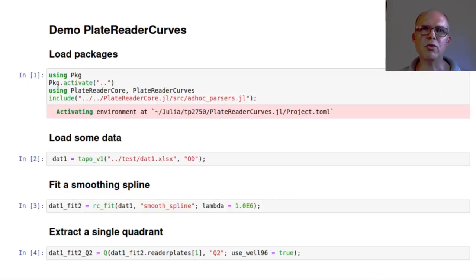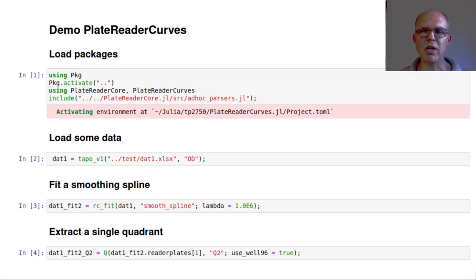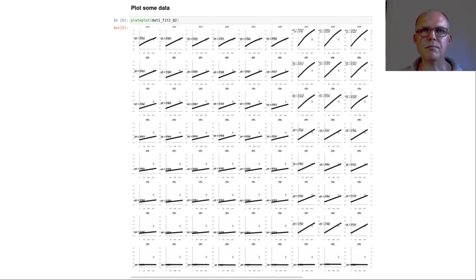Here's a short demonstration. First I load the packages. Then I load some data. Then I fit a smoothing spline to the data. Then I extract a quadrant out of a 384-well plate. I can plot it like this — not as nice as what I have in R, but still very useful.